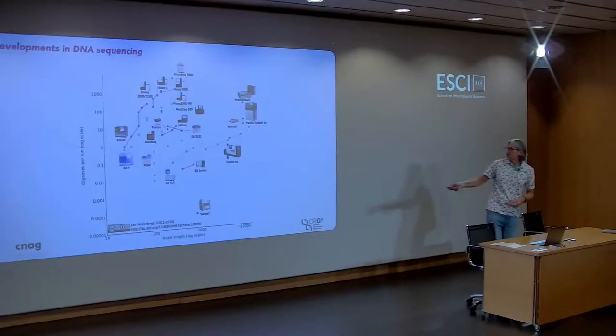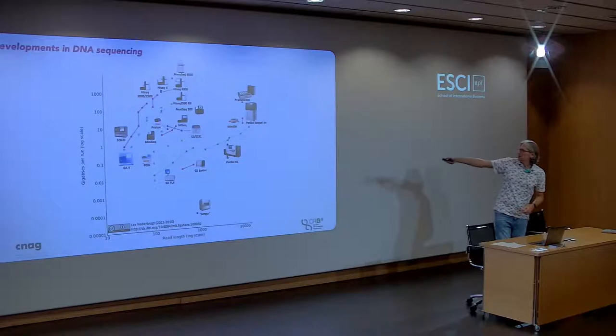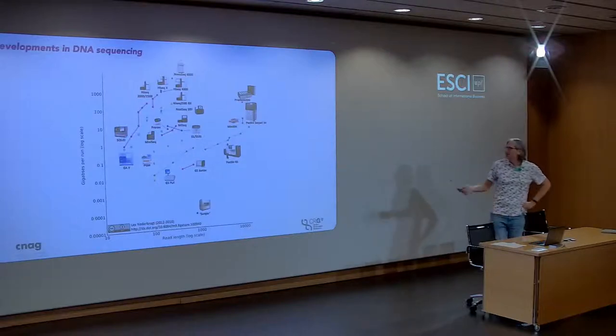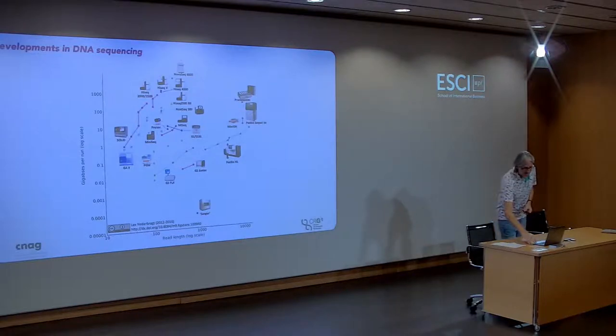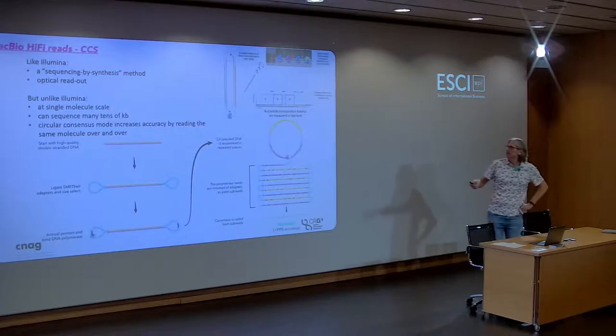So we have other technologies that came along. PacBio sits about right here, and then they have their improved machines, and probably this year they're going to have something else coming out. And it's a very similar technology in the sense that it's also sequencing by synthesis. Sorry, there's a delay.